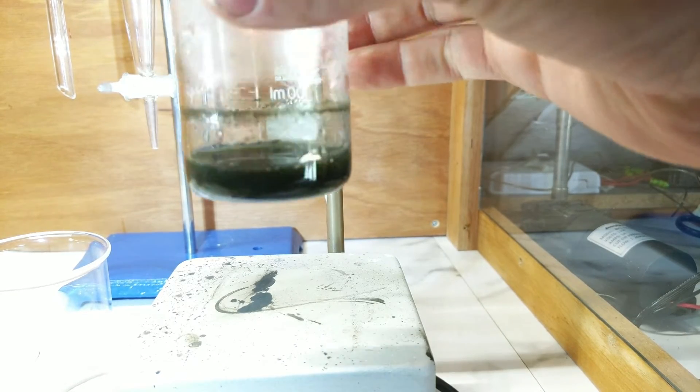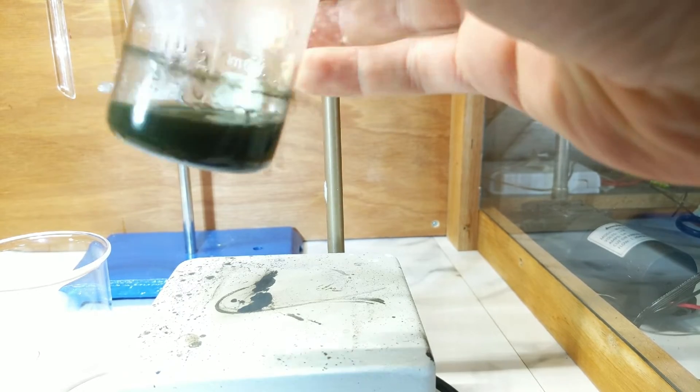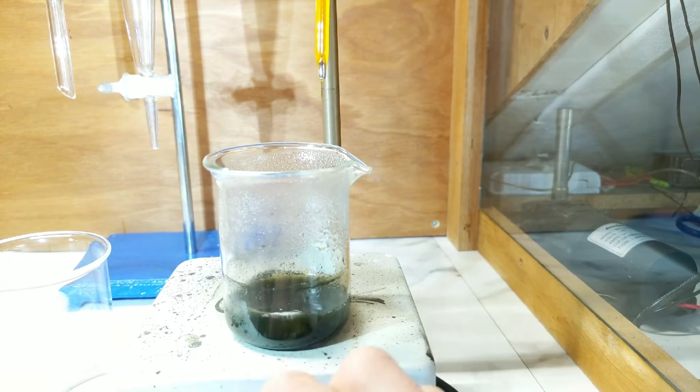All I'm going to do now is give this a quick filter to get all the little iron filings out, and then move on to the next step.